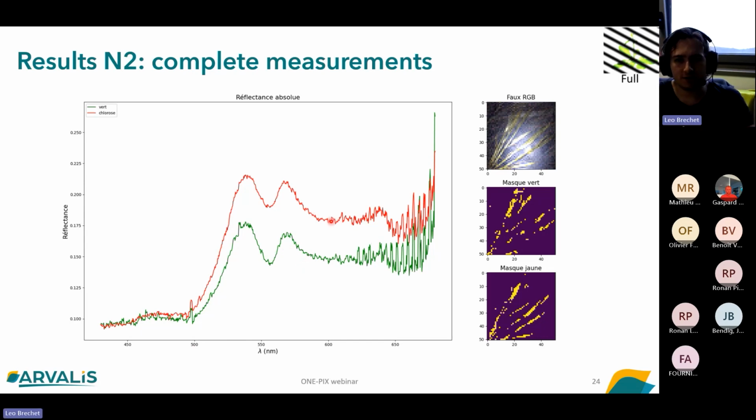I chose this image because we used it to see immediately that there was a problem of saturation, just as you can see here. And I wanted to say that it was fixed immediately, so we don't have this problem anymore.